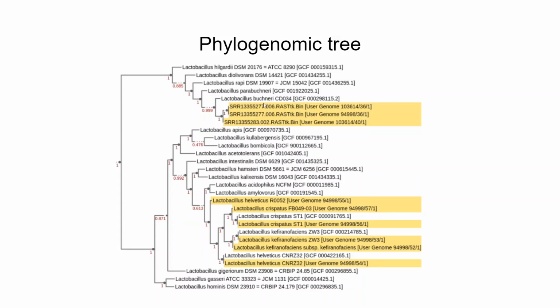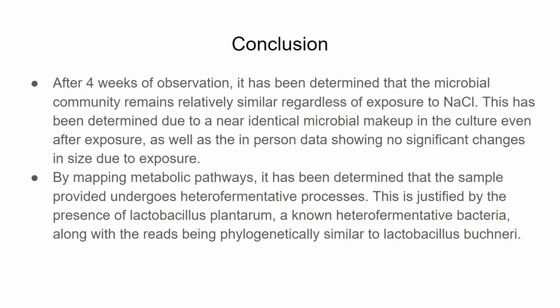So in conclusion, after 4 weeks of observation, it was determined that the microbial community remains relatively similar regardless of exposure to NaCl. This has been determined due to a near identical microbial makeup in the culture even after exposure, as well as the in-person data showing no significant changes in size due to exposure.